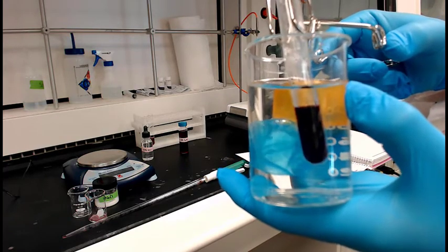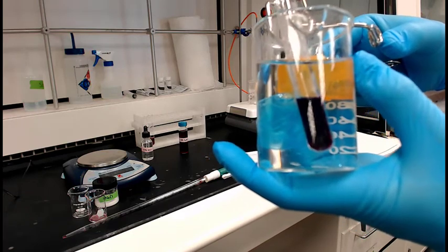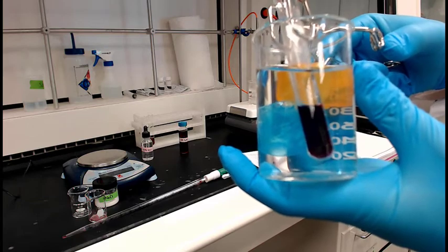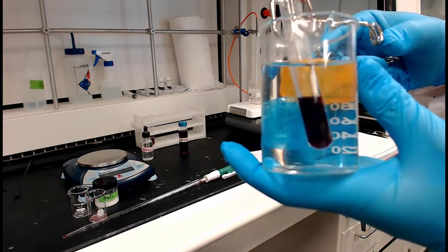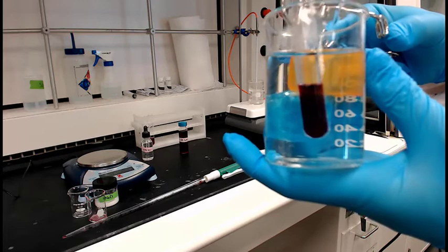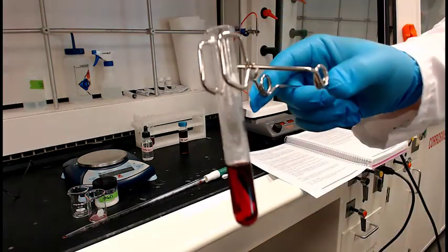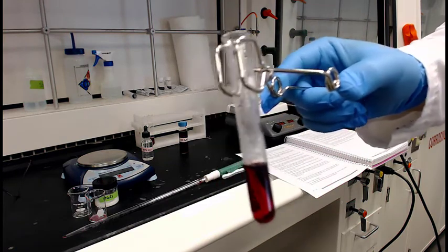Put it back in the cold. Again, it's kind of hard to see the perspective because you've got blue cubes. That was a bad choice on our part. Probably should have chosen some different colors to put in there so it wasn't taking us out. But if you cool it down, then pull that out and set it over the white background, it's pretty obvious. Yep, that's a good pink color. Pinkish red. Good.